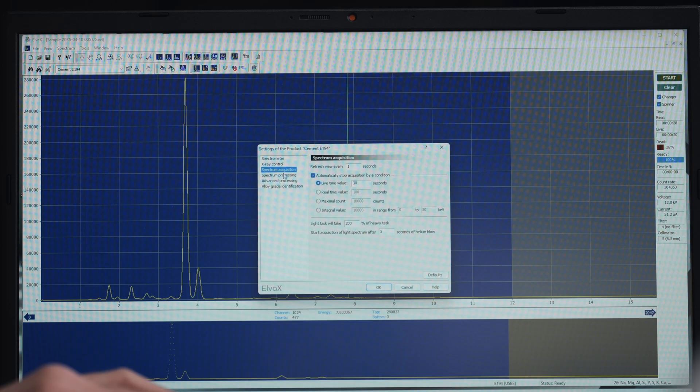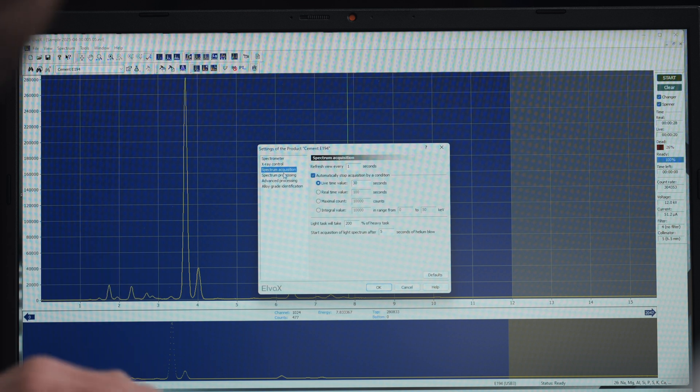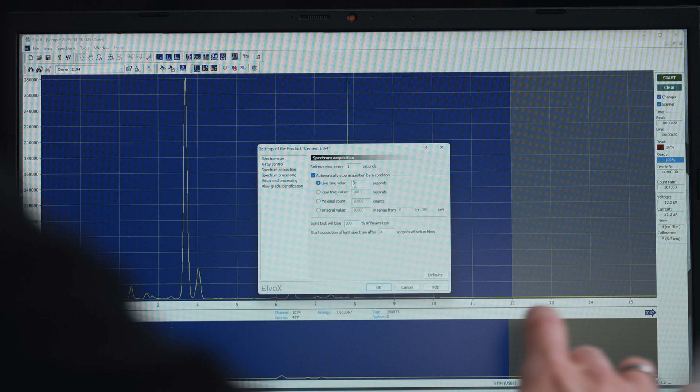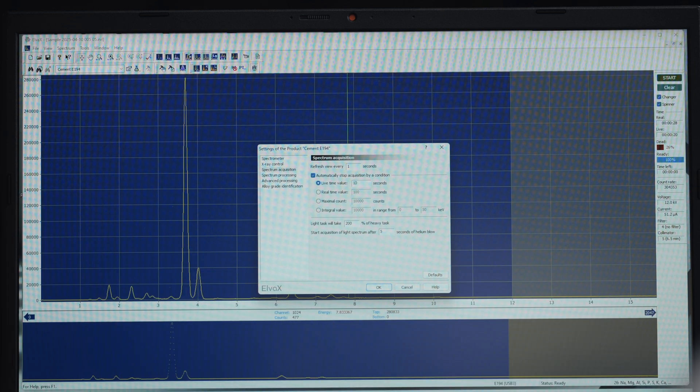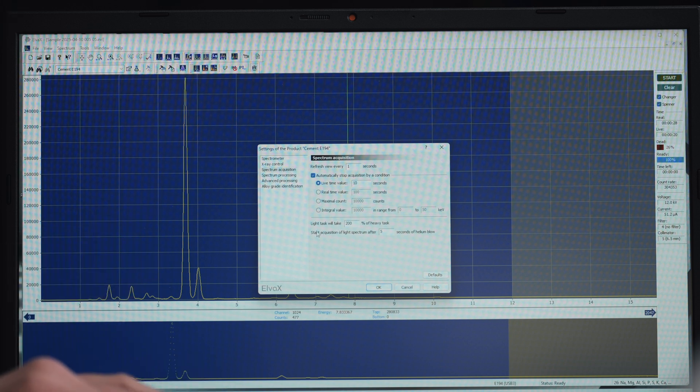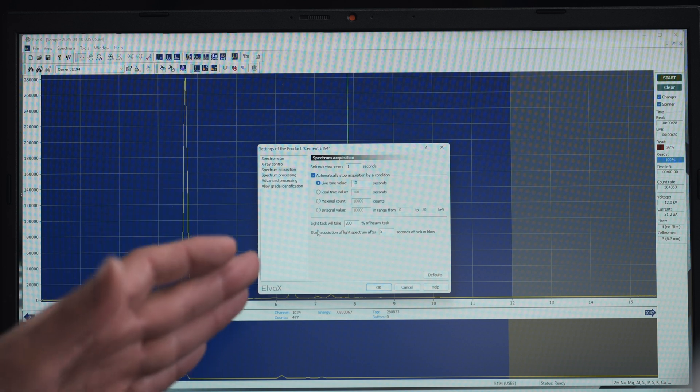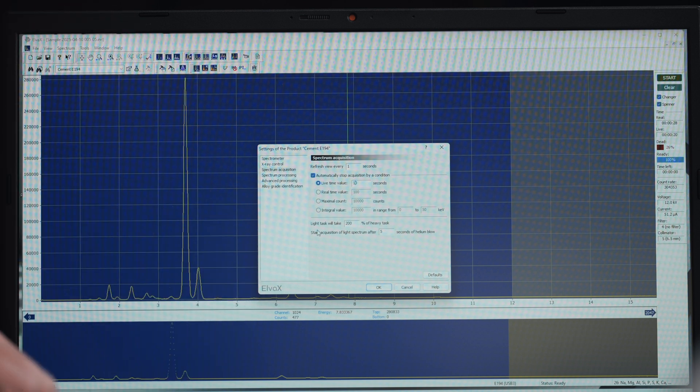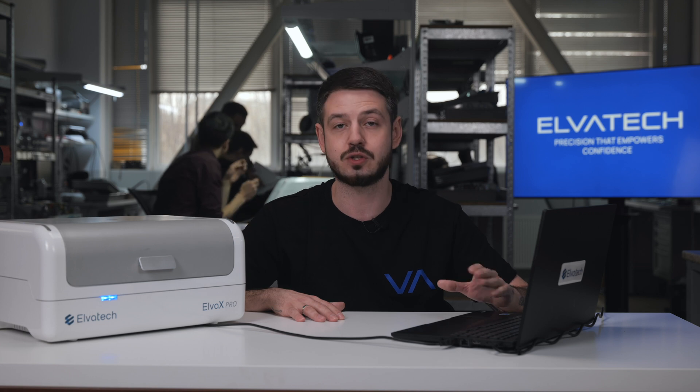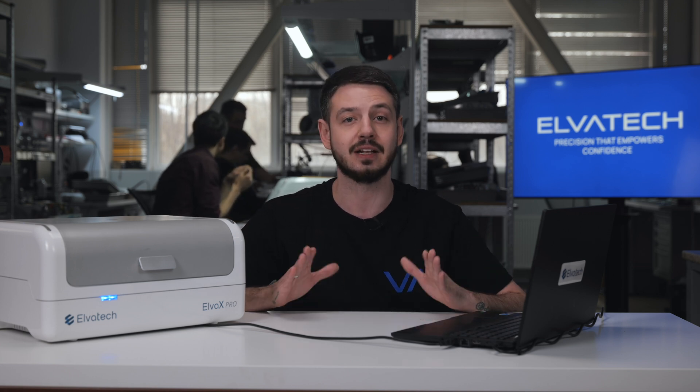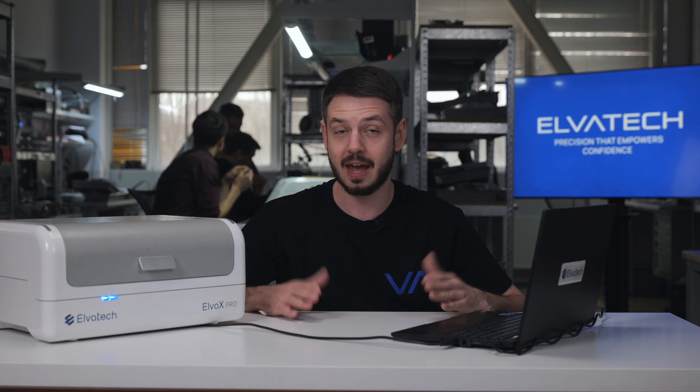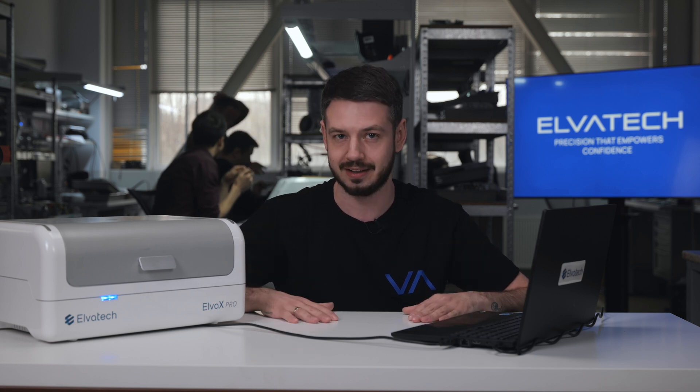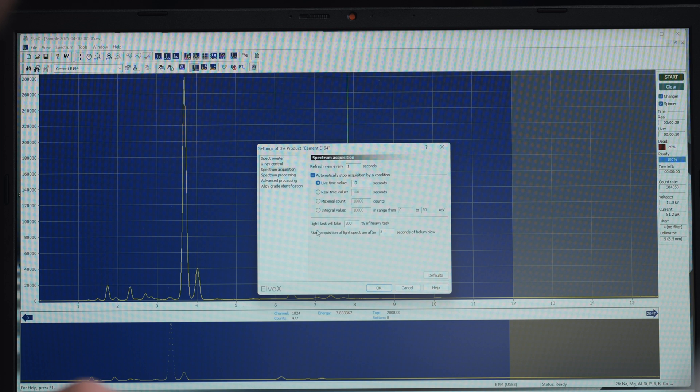Next step, we go to the next position here that's called spectrum acquisition. Here, we mark the live time value for 10 seconds, because it will be appropriate for us to measure the heavy group of elements. Right under it, we have the special mark here. Light task will take an appropriate percent of heavy task. We usually mark it to 200%, basically meaning that light task will take us 20 seconds. Overall, that's going to be 30 seconds for analysis. We mark it here.